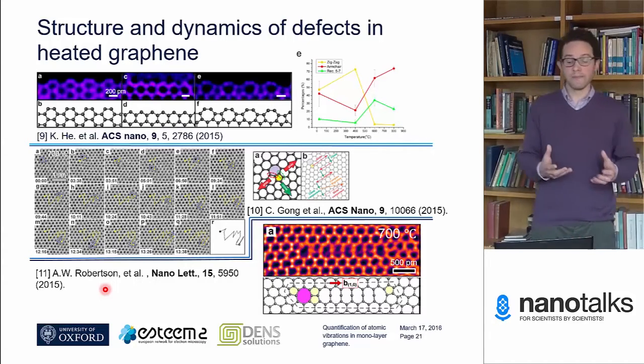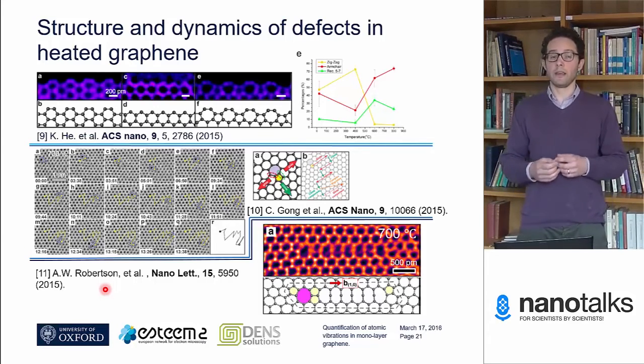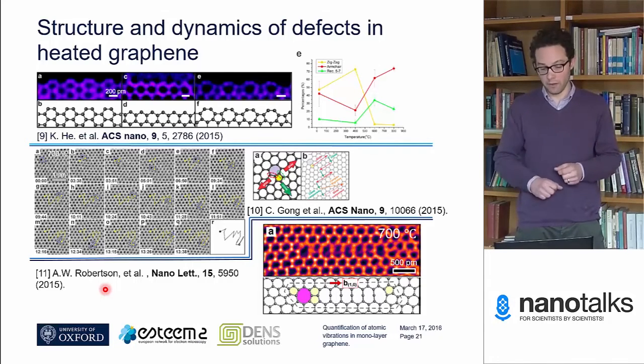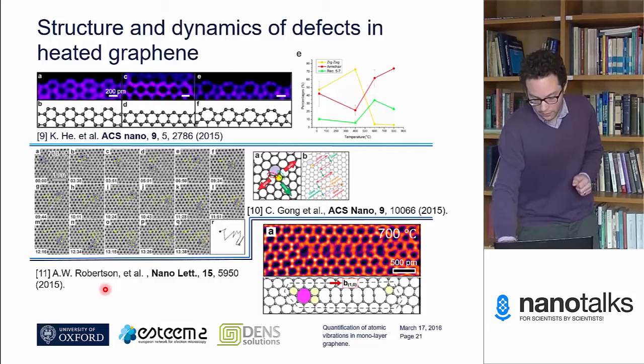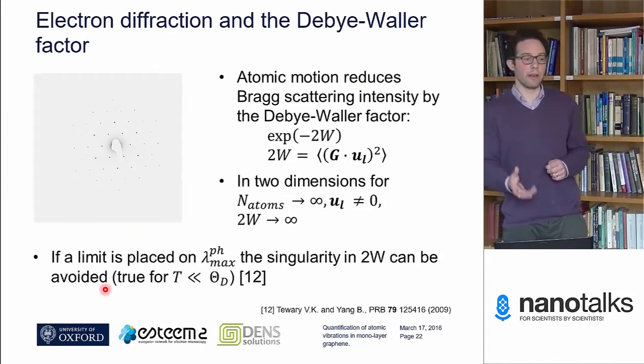So unfortunately, we can't capture this information directly from TEM images. From a TEM image, as I stated earlier, we're capturing the image over a few seconds. So we're seeing an average position of our atoms over those few seconds. We can, however, capture this information from electron diffraction patterns.